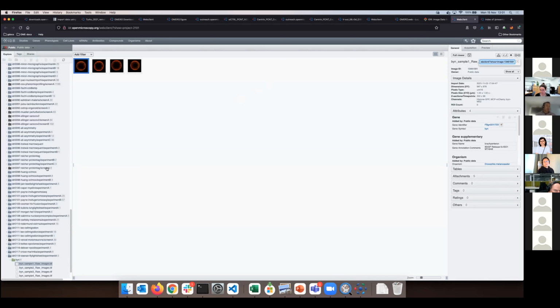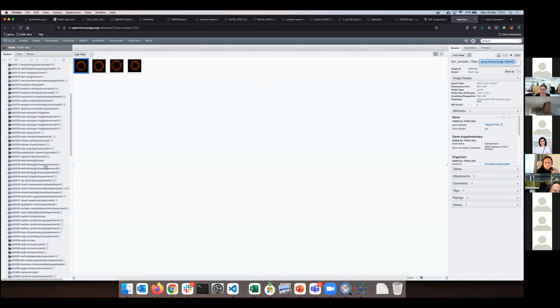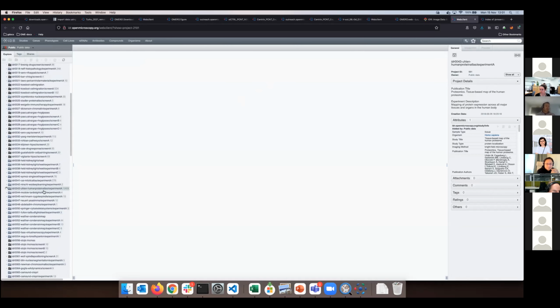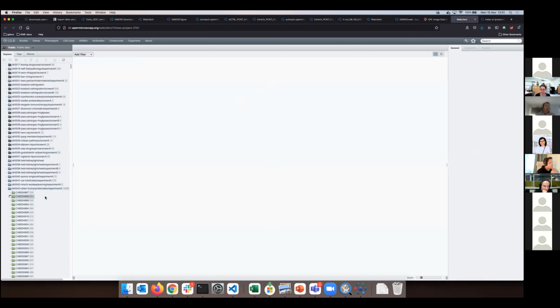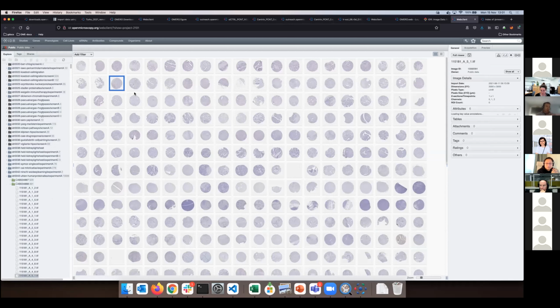The data are getting very big, and when you do CLI import, you can tune it in parallel, so you can do parallel import. So at that stage, when you are with big data, effort needs to be put in with IT to say what is the best strategy to get this data in, and by in it means that Omero is aware of this data. This data, as I said, could stay where they are at the moment. If you remember the setup in Tuku, you could imagine having a Samba share, for example, and Omero just becomes aware of the data.